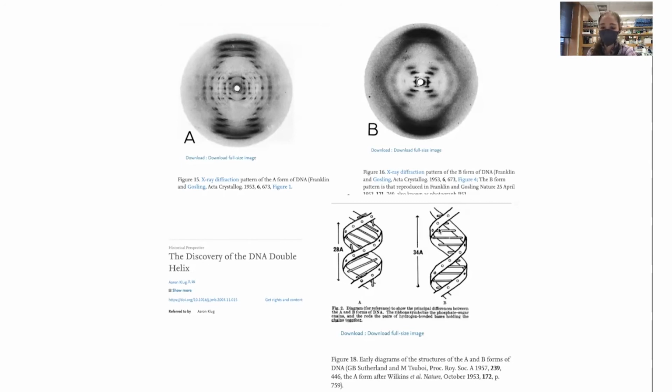B DNA is the main form of DNA. What happens with the A DNA is that you squish it down more. Even though you are squishing it down, you actually have 11 nucleotides per turn. Even though the pitch is shorter, there's another base in there, so you have 11 bases per turn instead of 10. They adopt a 20-degree tilt, and this makes it so that only 2 of the bases per turn are hit edge-on by the X-rays, so you don't get quite as strong meridian arcs.